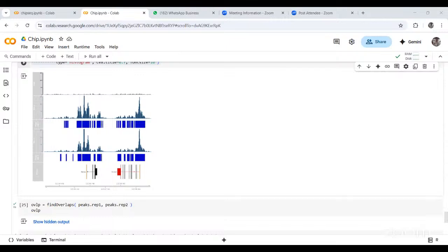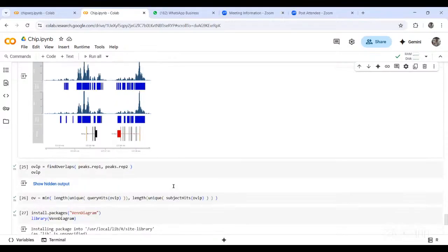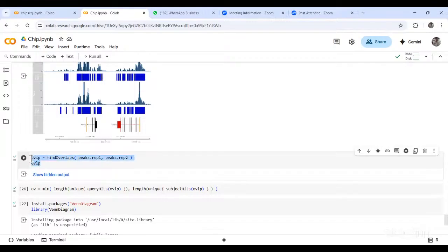As I told you, one of the major functions we are using is MACS. These are all the steps for MACS. You can see that MACS has successfully identified regions showing high H3K27ac signals. We say that both the biological replicates agree as well. However, in some cases, peaks are called only in one sample. Okay, let us go further. So we'll find out the overlaps.